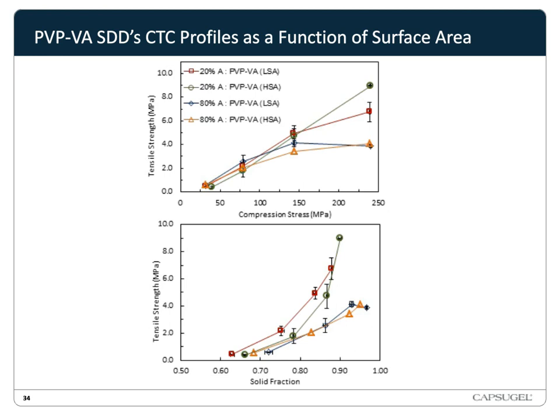When we see something like this during development, it allows us to look at other things to optimize, like powder flow. So if the low surface area SDDs have the same or acceptable dissolution as the high surface area SDDs, we would select them because generally the lower surface area SDDs have much better powder flow properties.